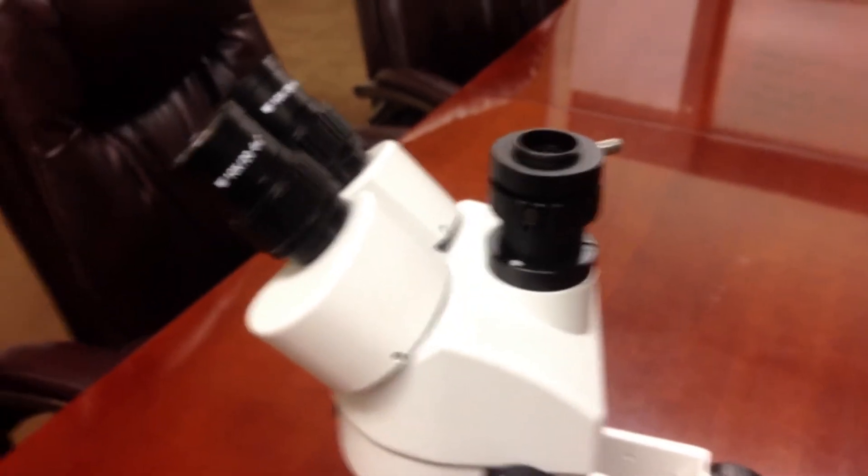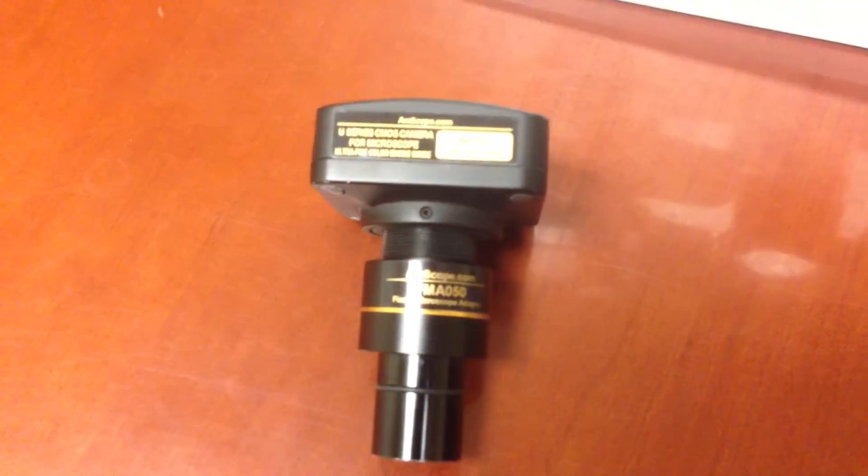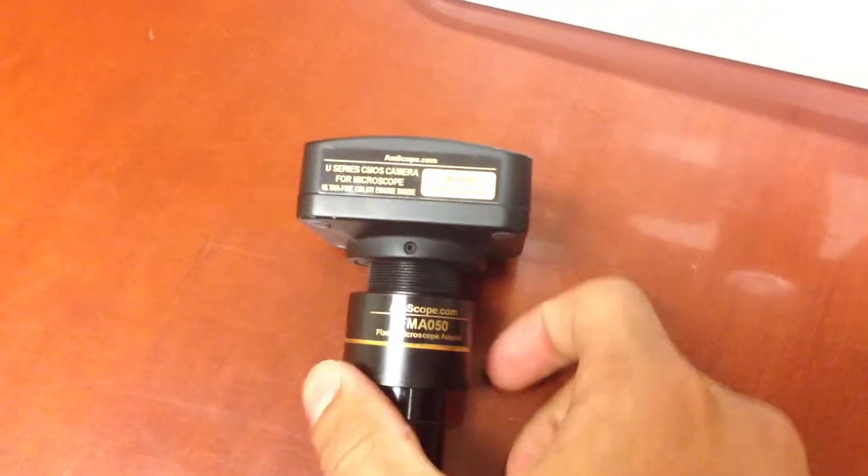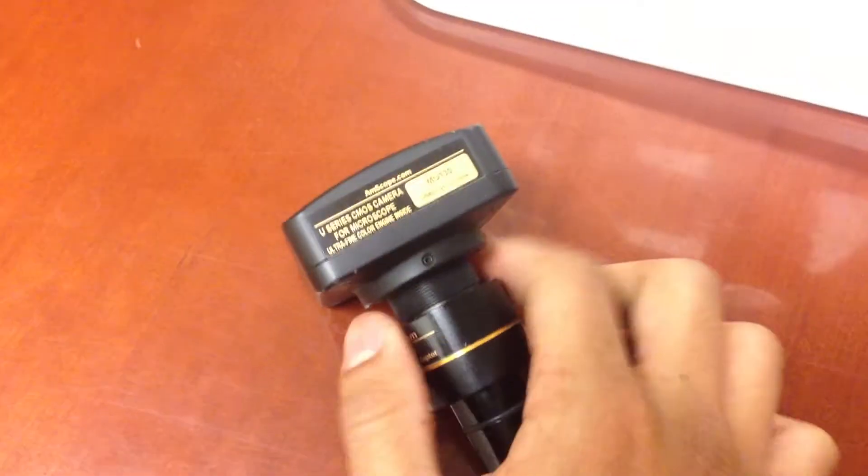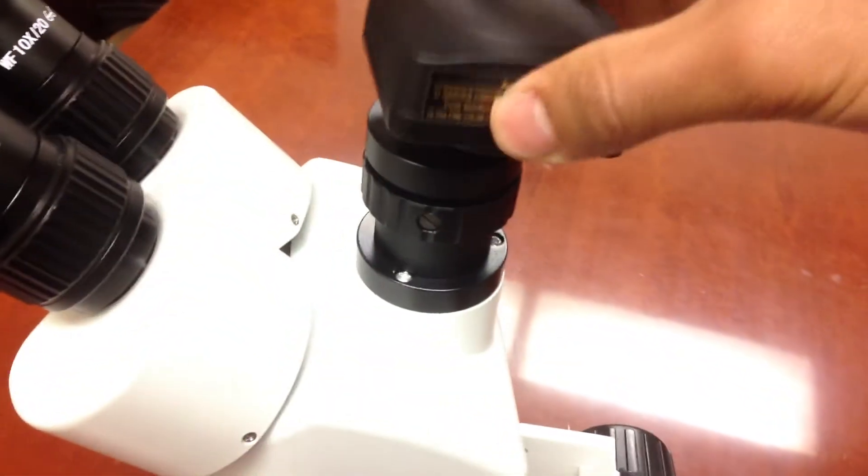So that's part A. Part B is unscrewing the reduction lens from the camera. And for video purposes, again, I already unscrewed it. So just easily remove. There's the new part. Then you get the head of the camera.